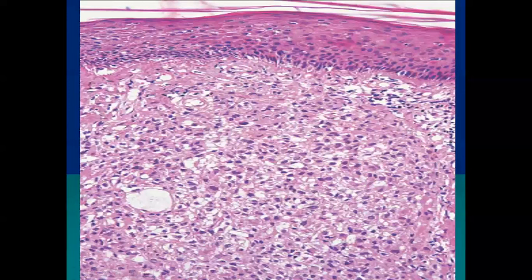This image shows macrophages with vacuolated or foamy cytoplasm in diffuse sheets. There are only two differentials: xanthomas or lepromatous leprosy. If Touton giant cells are present alongside the foamy histiocytes, xanthoma becomes the more prominent diagnosis. If granulomas are present with foamy histiocytes, lepromatous leprosy becomes the more prominent diagnosis.